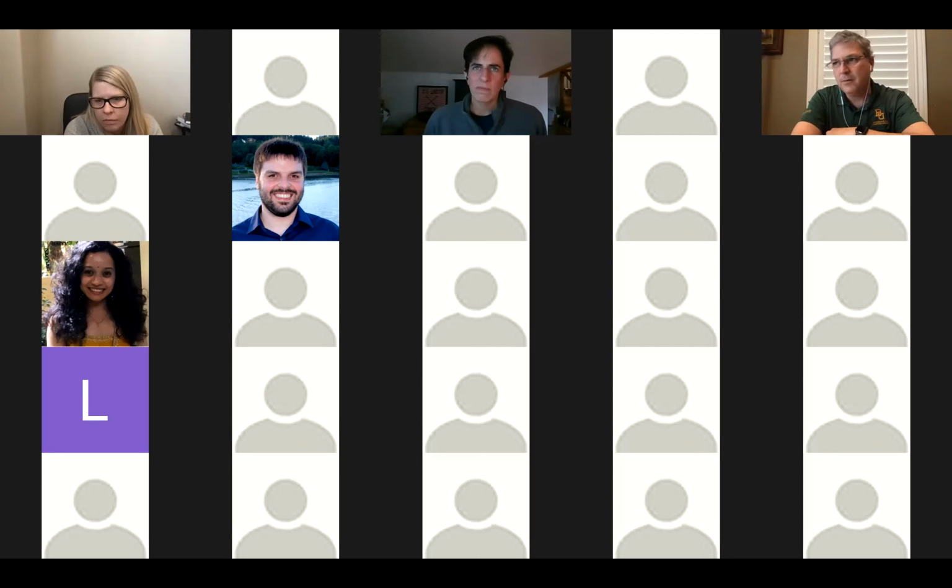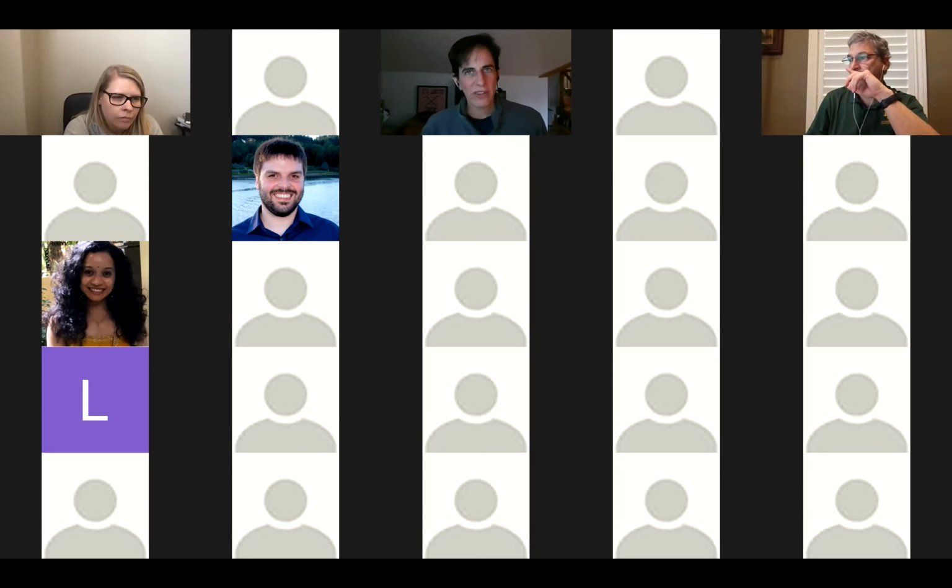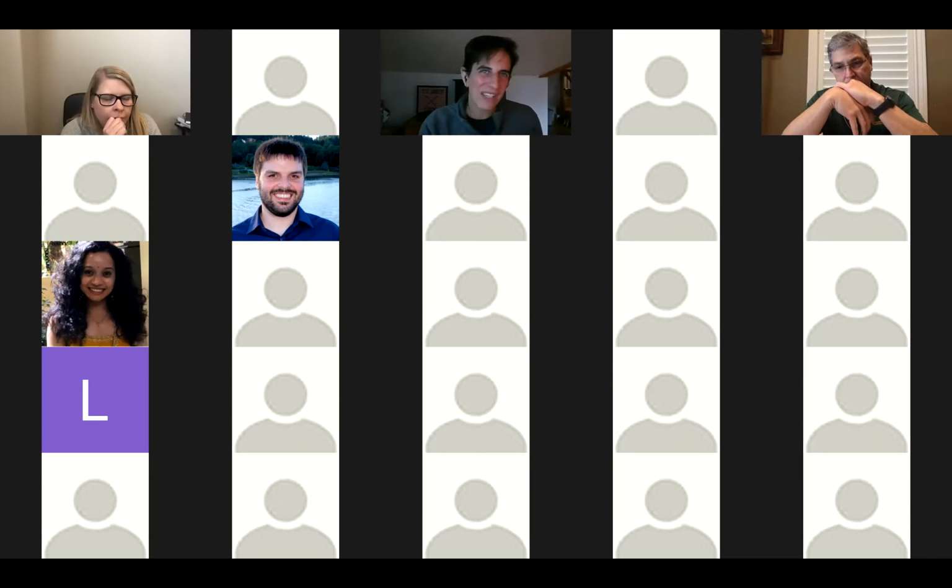Elissa, have you and team begun to integrate single cell RNA-seq specific gene sets semi-automatically? We've discussed it with some groups, but we haven't done it. For us, the value, and I'm going to get into broken record mode, I suppose, is that where there's a lot of data, the tools become quite powerful. Now, taking one single cell data set, for like brain, and then using that to interpret the convergence of gene sets related to a disease or a behavioral condition is actually quite useful, right?